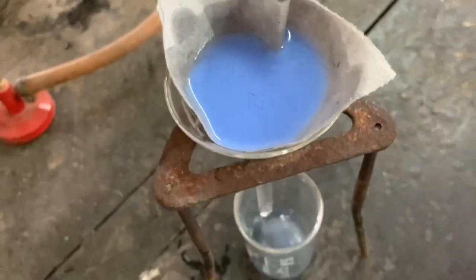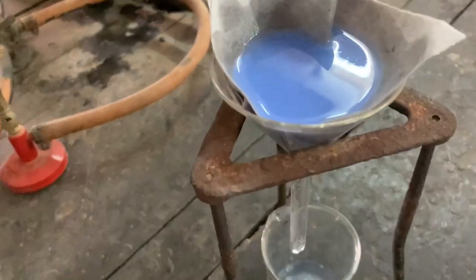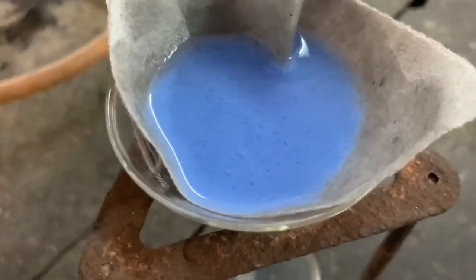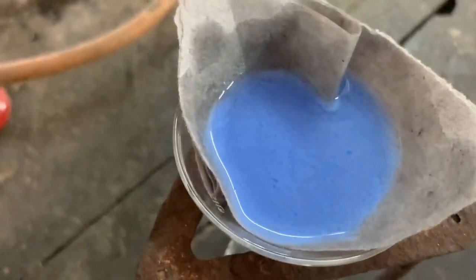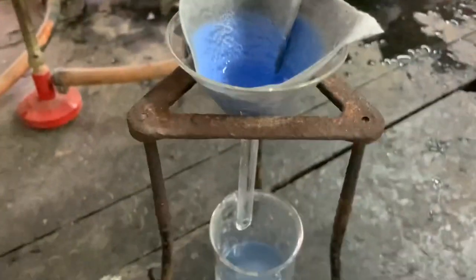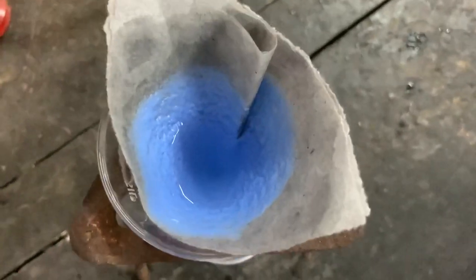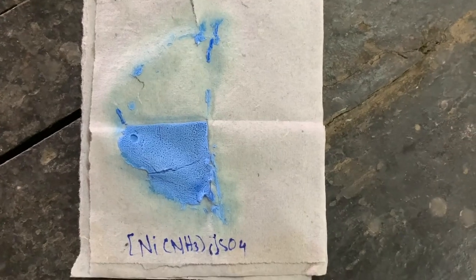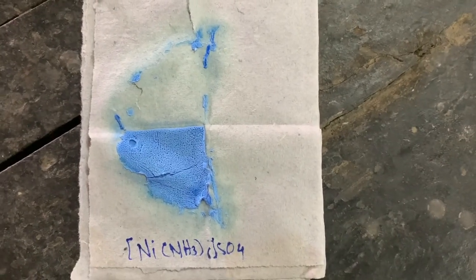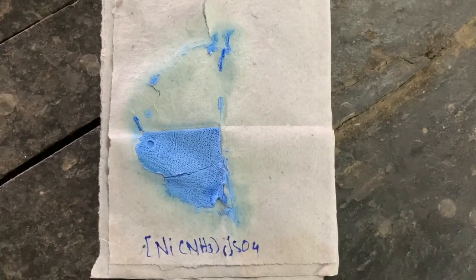Okay, so our complex is about to filter. You can see a very good precipitate of complex is settled inside the filter paper. So the filtration process is going on. You can see the complex is filtered here. This is our final product, which we have dried in filter paper, and this is the nickel hexamine sulfate complex.